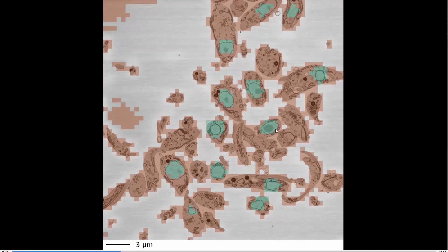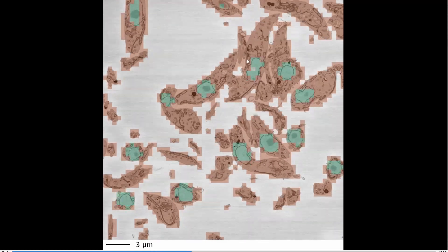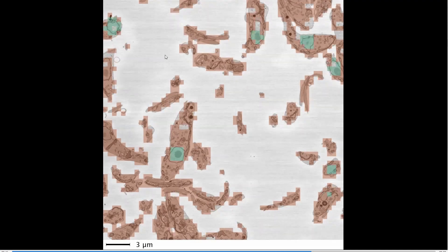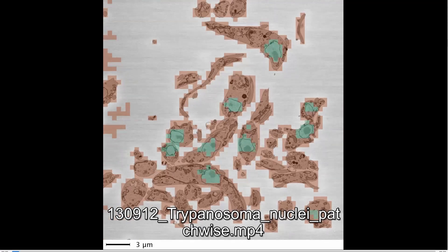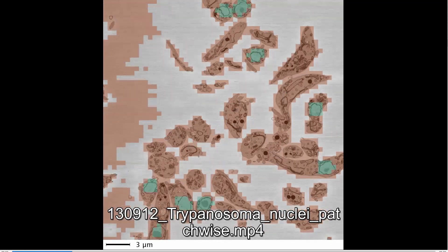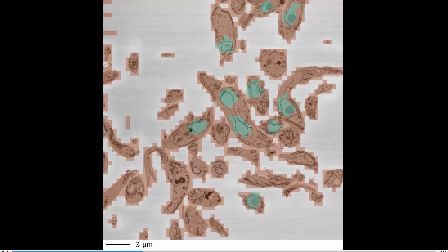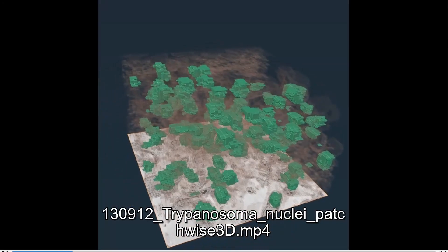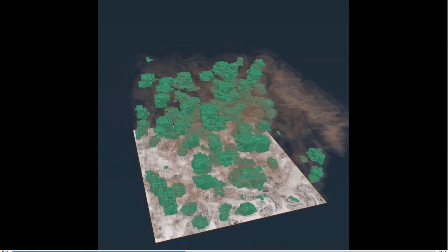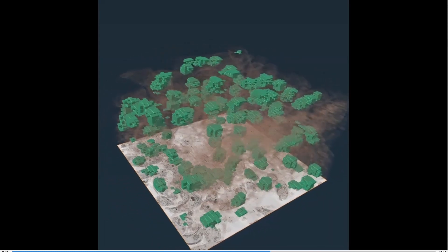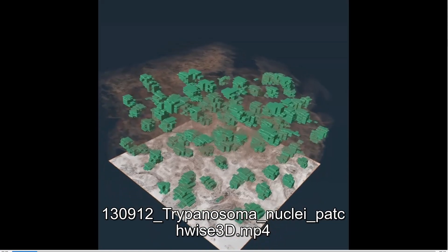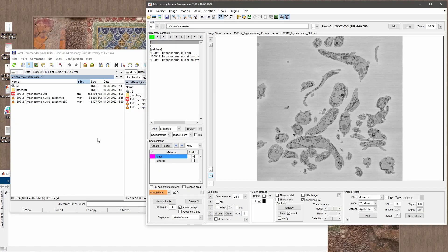The green areas show detected nuclei, the red boxes show locations of a background object — in this case cells — and the white areas were not used during prediction due to dynamic masking, which is also a new mode in Microscopy Image Browser. If I show this model in 3D, you can see the volume where the green boxes indicate locations of nuclei, and then we can guide our segmentation tools toward those areas for semantic segmentation.